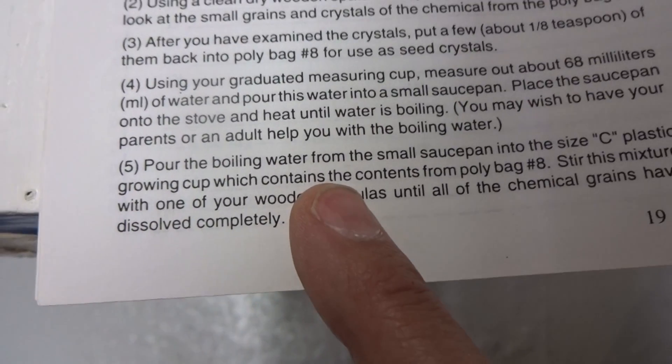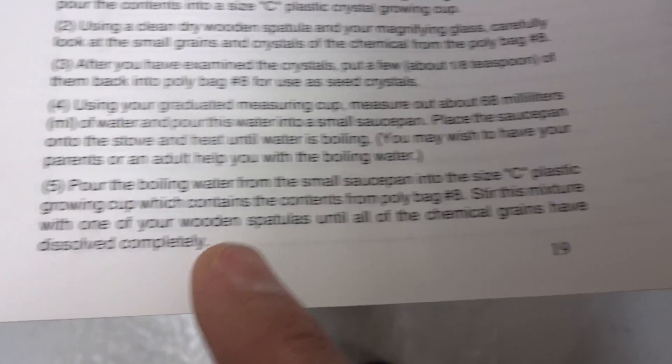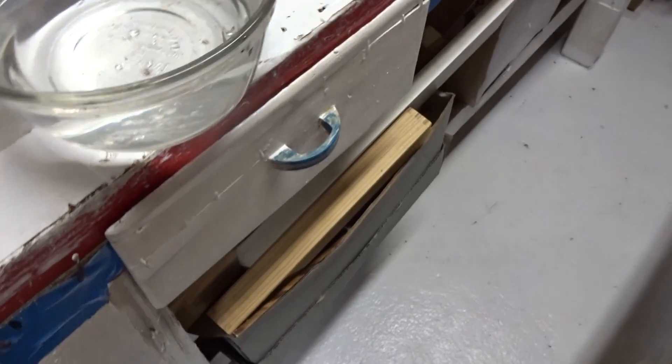Using your graduated measuring cup, measure out 68 milliliters of water. Let's use a graduated cylinder — they tend to be more accurate than beakers.